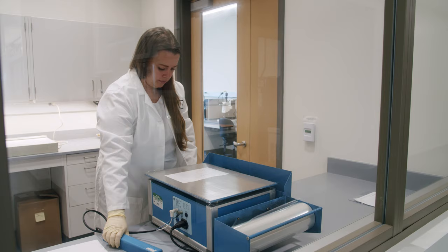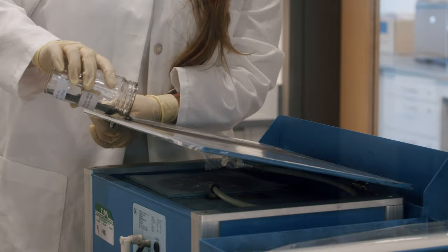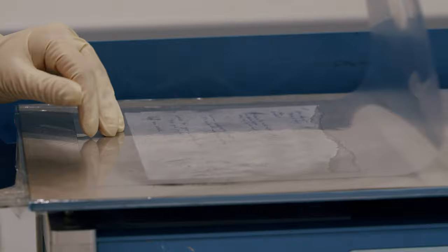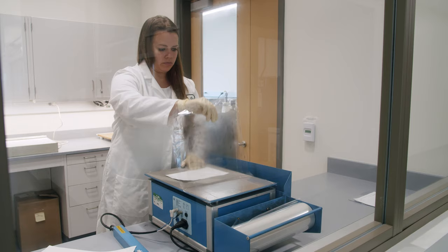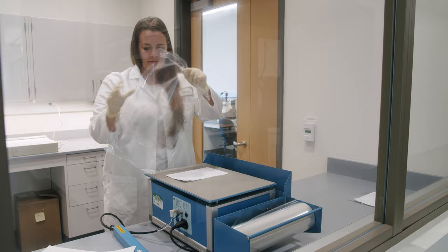Next, I took the document into the ESDA room. It's a humidity-controlled room because humidity kind of activates damaged fibers on a piece of paper. So the ESDA allows us to develop indented impressions on paper. When you're writing in a notebook or writing on a stack of pages, if you're using a lot of pressure, you're leaving indented impressions on the pages underneath. And this instrument allows us to develop those indented impressions and make them readable. On this particular document, there was a phone number in the upper portion of the document and some handwriting in the bottom right corner. And then in the middle of the document, you can see the white void of where the ballpoint ink is on the original document itself.